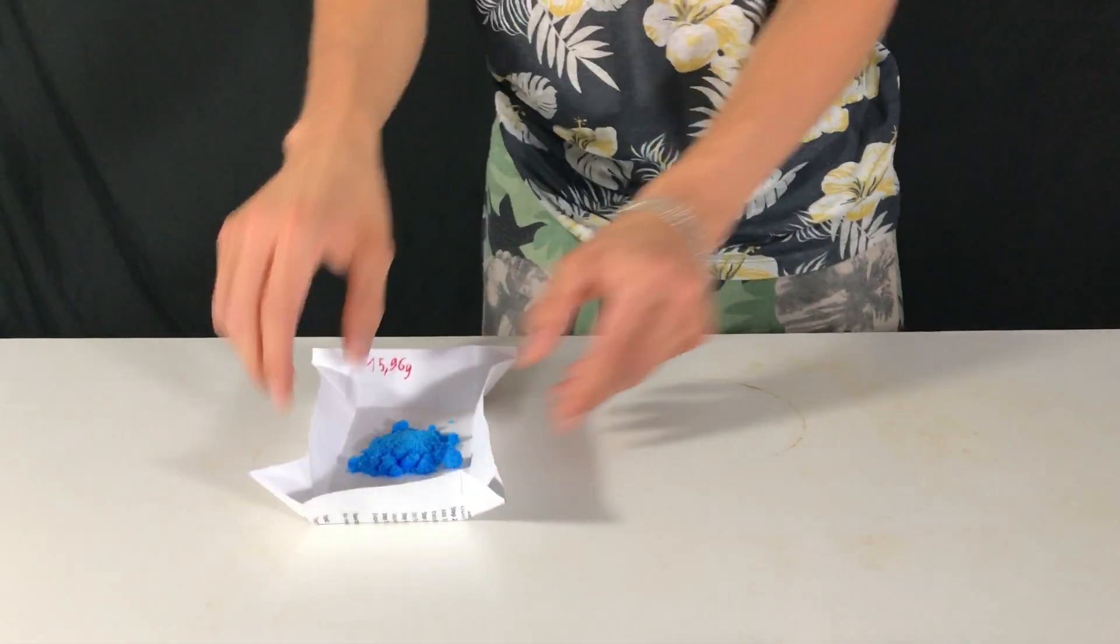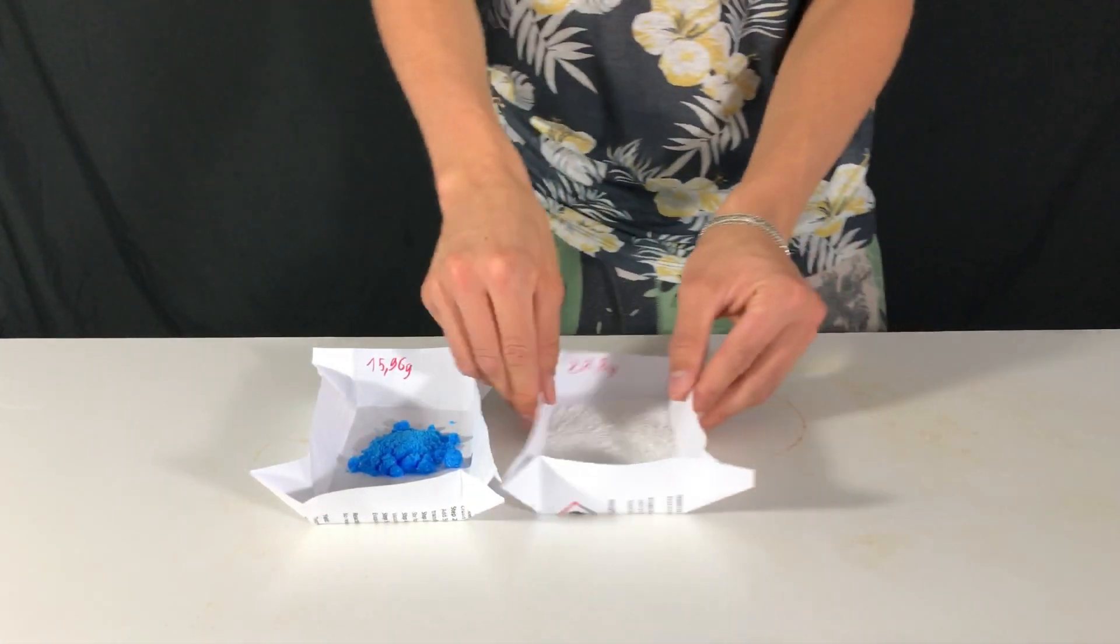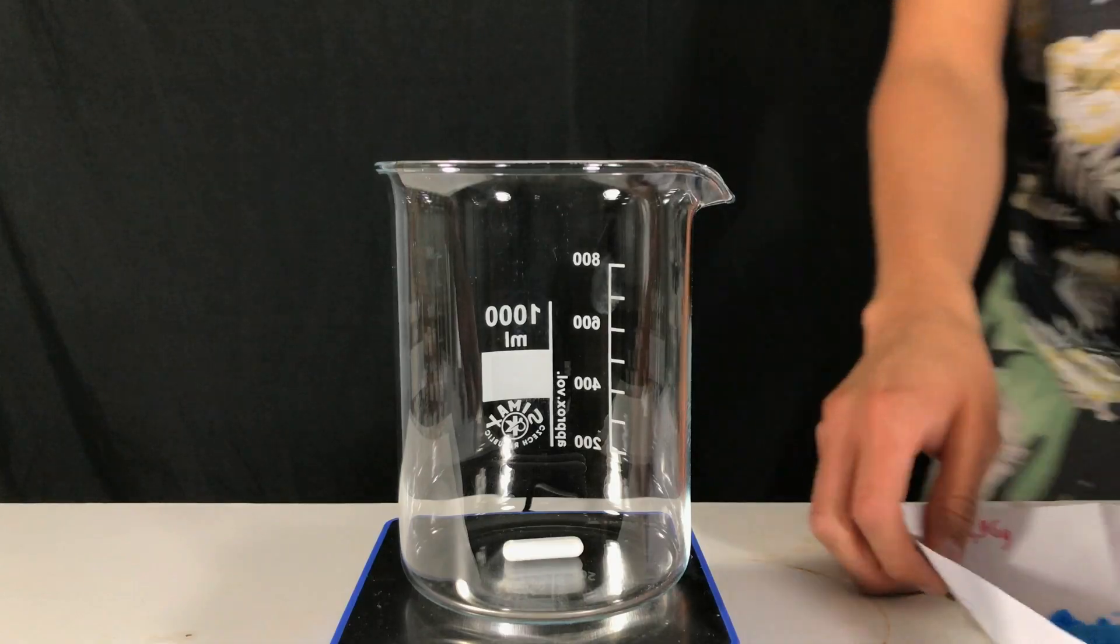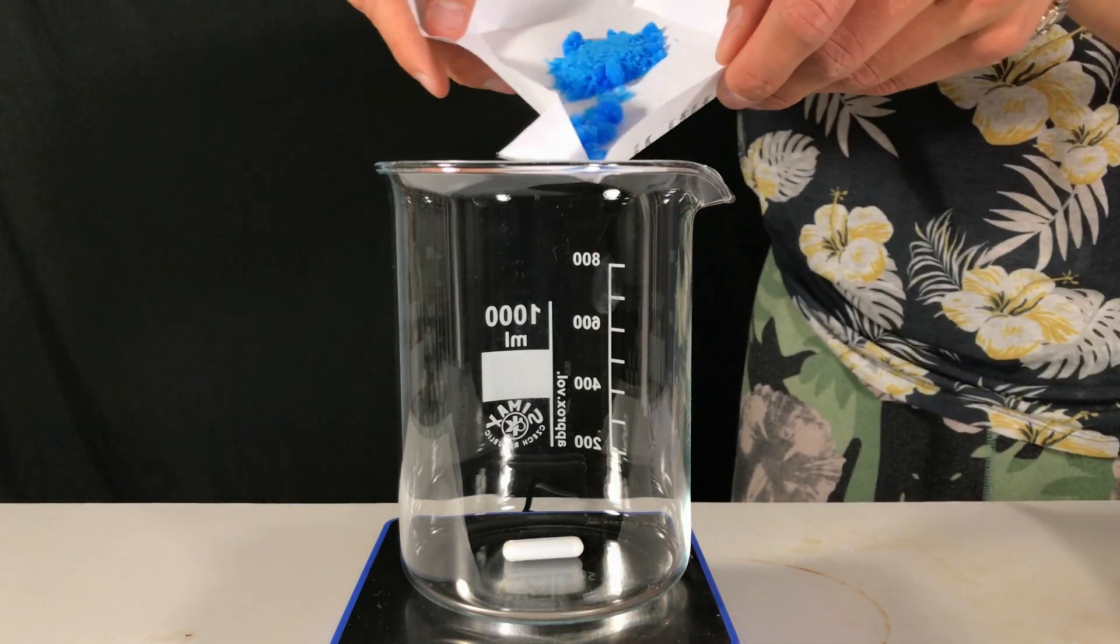15.9 grams of copper sulfate and 28.82 grams of sodium benzoate were weighed out in advance. The copper sulfate was then dumped into a beaker.